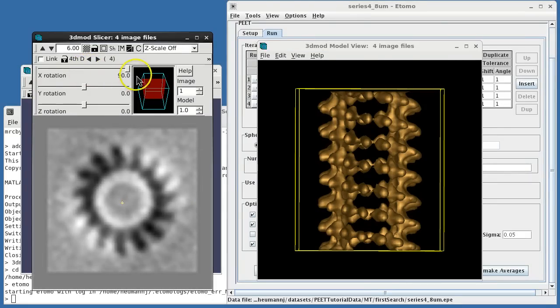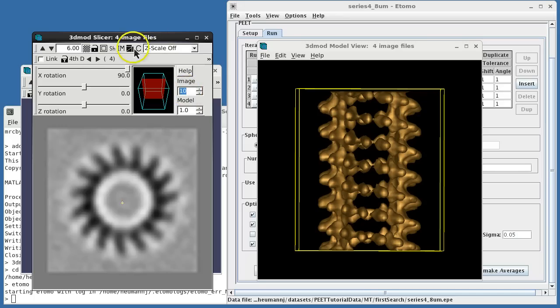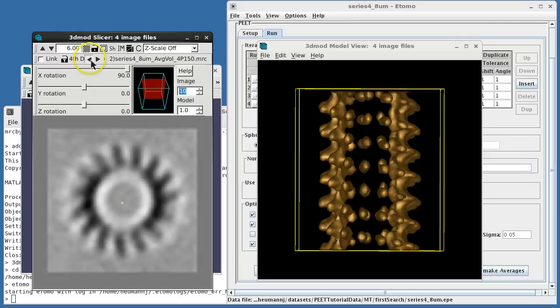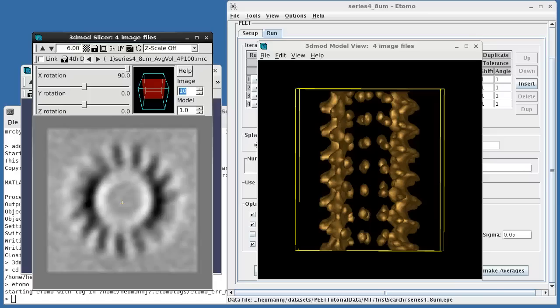Similarly, if I open a slicer window, and we look down the microtubule axis at a 10-slice thick section, you'll see that the resulting average appears nearly isotropic with all 242 particles, but the lateral smearing is visible when using just 100 particles. This smearing would have been considerably worse had we not selected random axial rotations in the initial motive list.